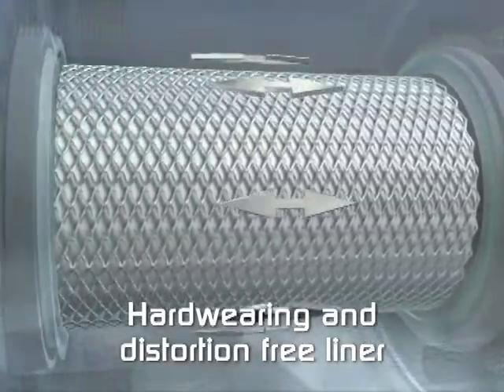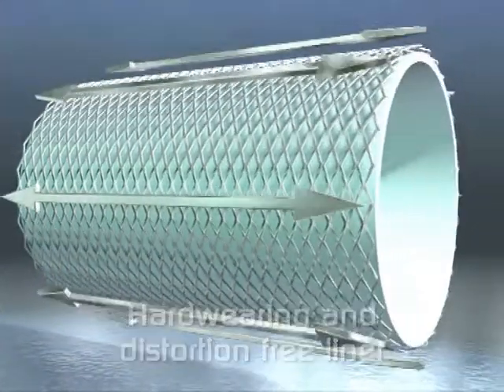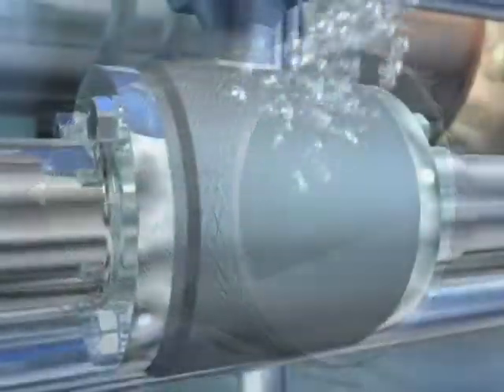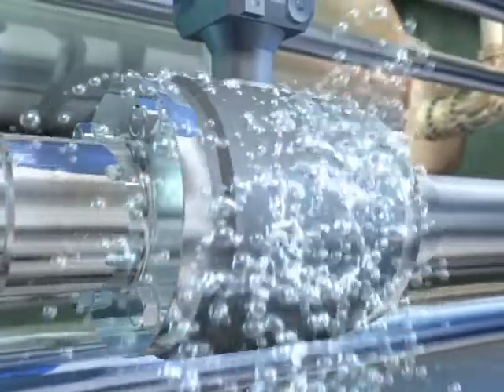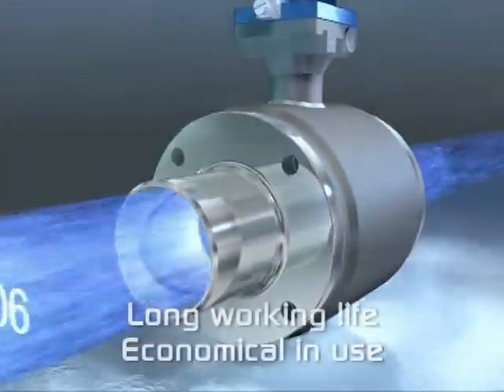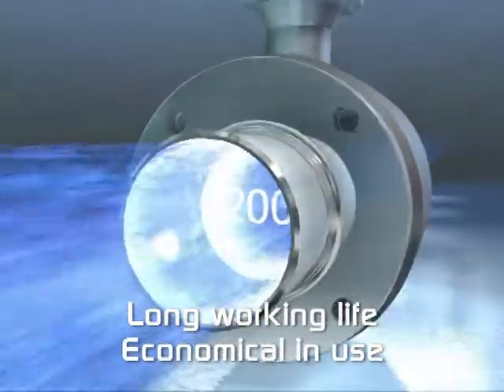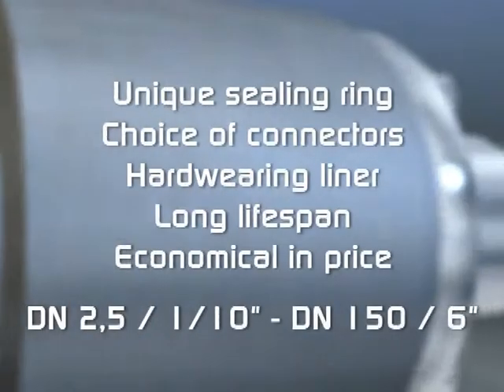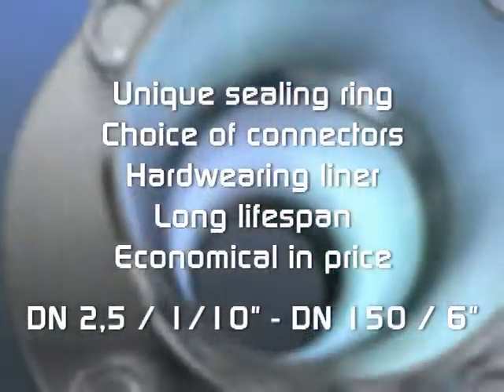The unique diamond-shaped mesh, supporting the PFA liner, prevents any inward distortion that would lead to a shift in results. The outside skin of stainless steel is not affected by hosing down the plant. The long life of Kronometers is legendary, and the pricing is bright. Optiflux 6000 — a quantum leap in hygienic flow measurement using electromagnetic flow meters.